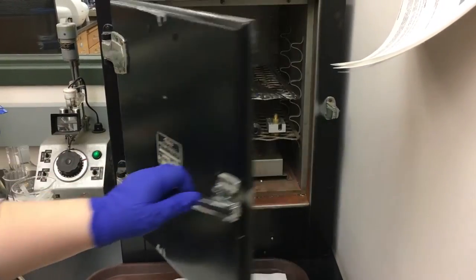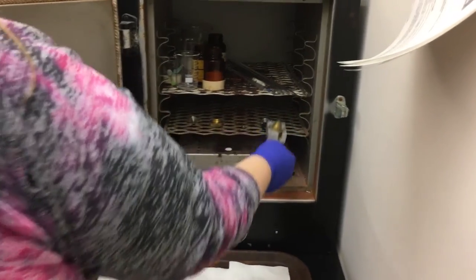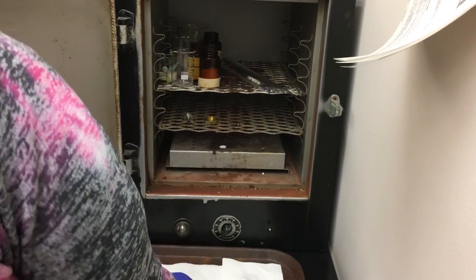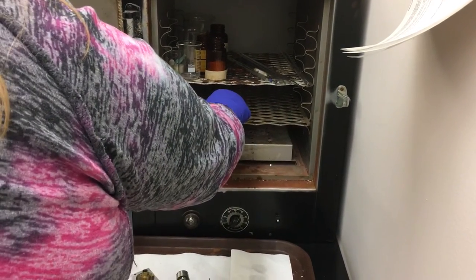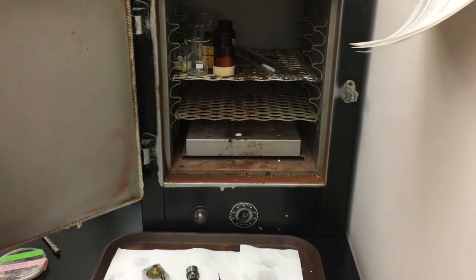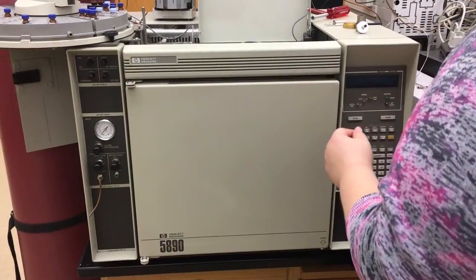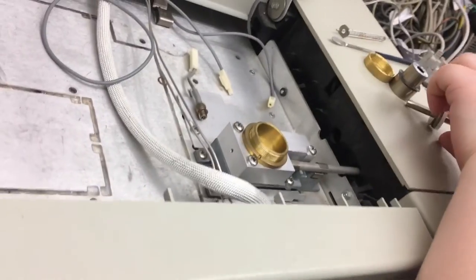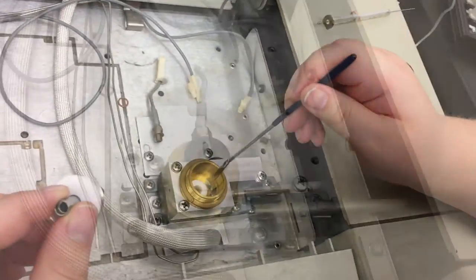After an hour has passed, remove the components from the oven, taking caution of the heat. The FID and the housing unit will then need to be placed back into the GC and reinstalled.